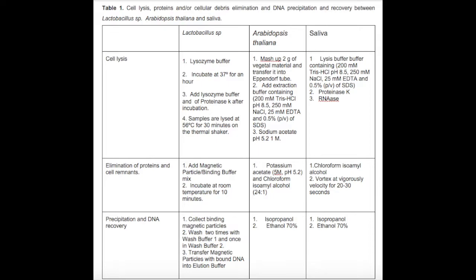To degrade bacterial cell walls, it is necessary to use enzymes due to the peptidoglycan wall that cannot be degraded with detergents. The use of enzymes is also necessary to degrade plant cell walls because they possess a primary and secondary wall, which develops in a propagated form to the cellulose microfibrils arranged in an orderly manner, with a denser structure than the primary wall.